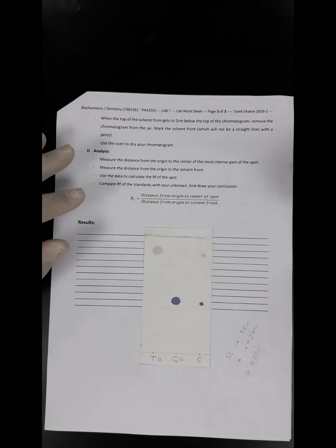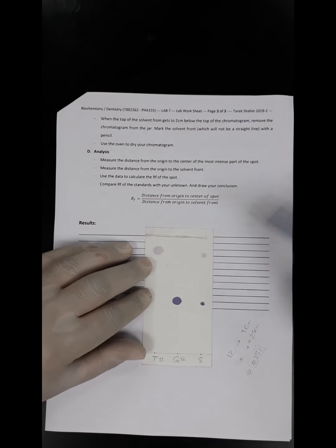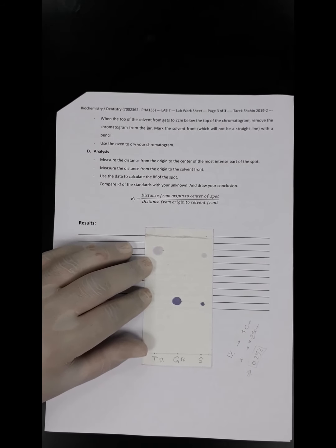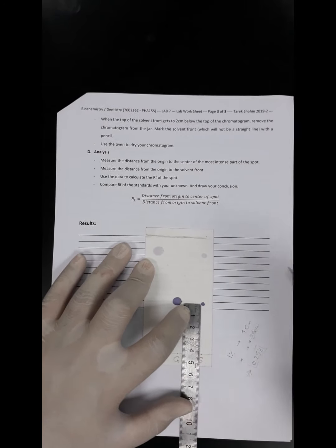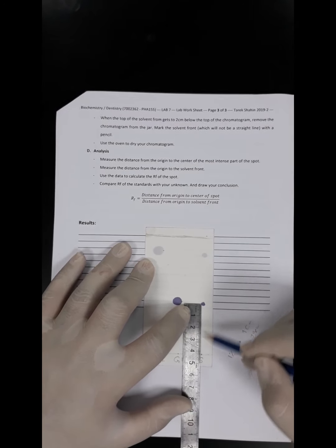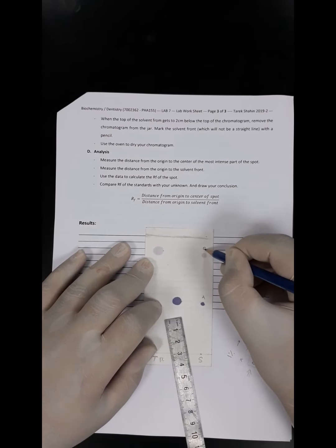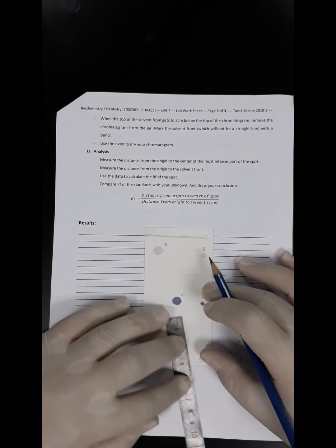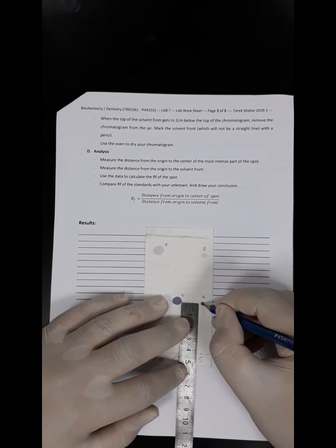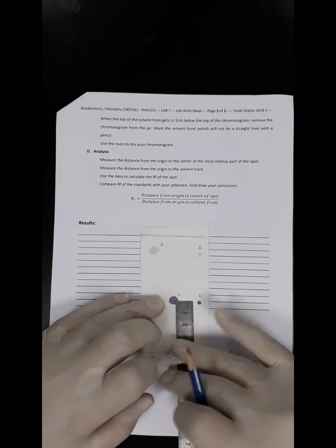One more factor we have to know is the retardation factor, and there is another one, the retardation fraction. For the retardation factor, how can we calculate it? It's very easy. We will get a ruler and find the distance traveled by the spot. Let's name these spots spot A, spot B, spot C, and spot D. For spot A, this is the center of the spot, so we measure the distance traveled from the start line to that spot.